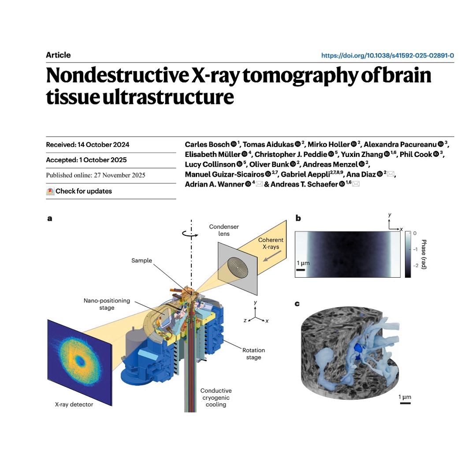But before they could even aim for 20 nanometer, the researchers had to prove they hadn't just created a high-resolution image of damaged brain. Right. How do you prove the X-rays didn't just scramble the tissue? You use the ultimate ground truth, correlated imaging. After they finished the X-ray scan, the PXCT measurements, they took the exact same specimen and put it through FIB-SEM.